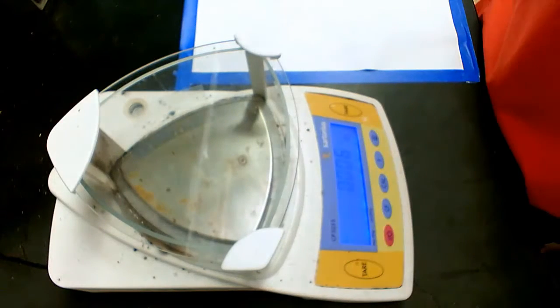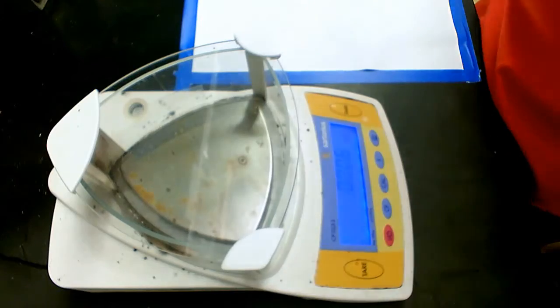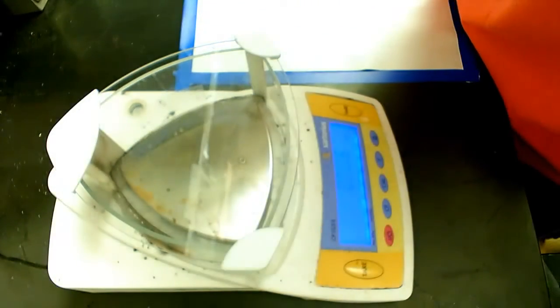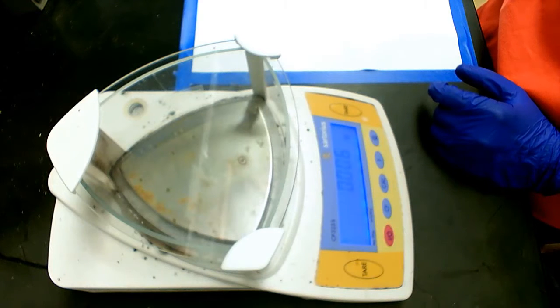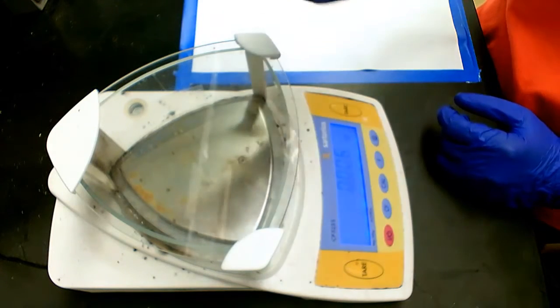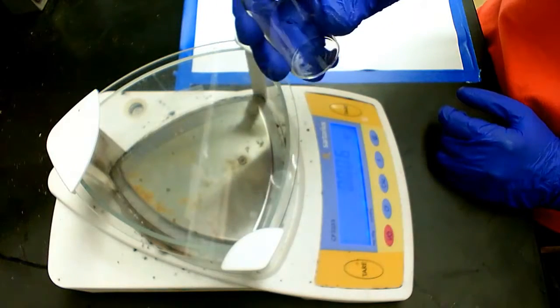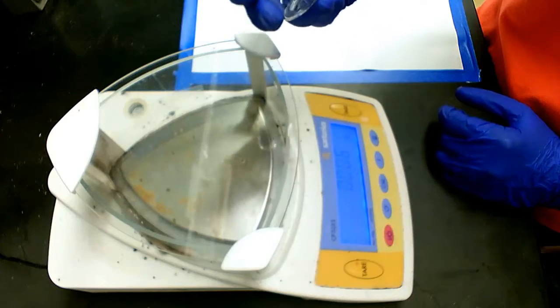So in this video I'm going to show you how to make a polymer thin film. To get started, we first need to prepare a polymer stock solution. You're going to use those 20 milliliter vials to prepare the solution.